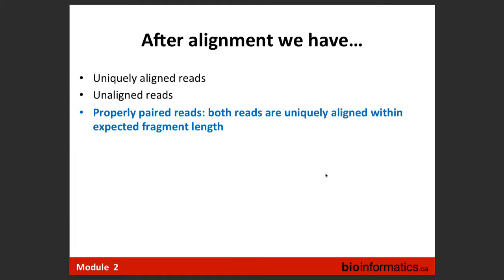So then, as we already discussed, most of our libraries, even for ChIP-seq, are paired-end. And then we have another characteristic: reads in pairs can be properly paired or not properly paired.